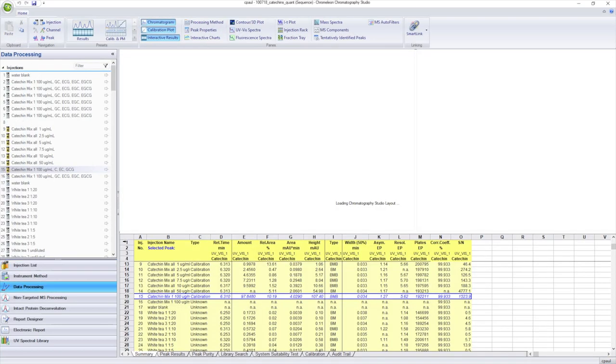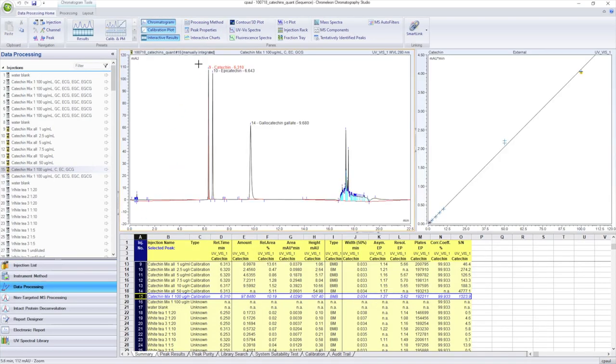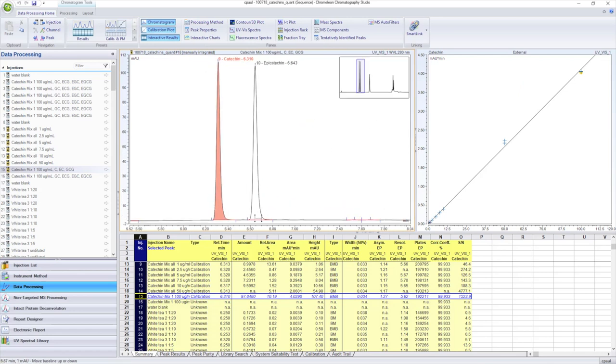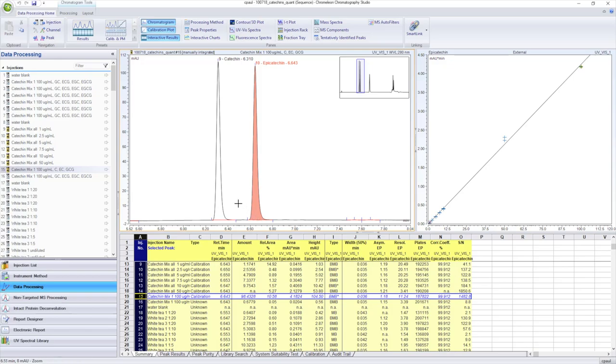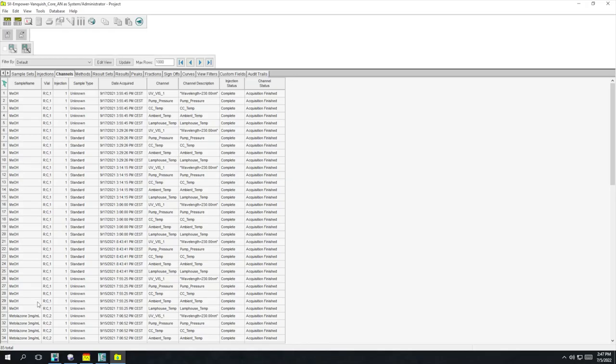The Thermoscientific Chromelion Chromatography Data System software provides Vanquish system users with the most advanced and intuitive software available for instrument control, 21 CFR Part 11 compliant data handling, and effective reporting.